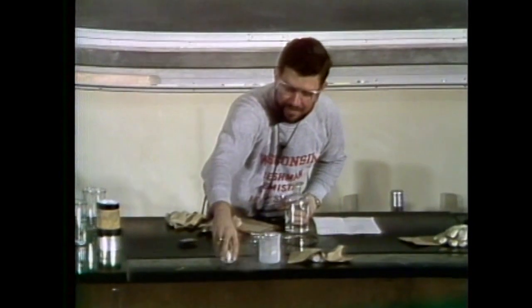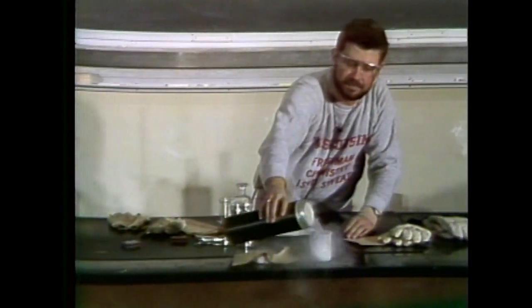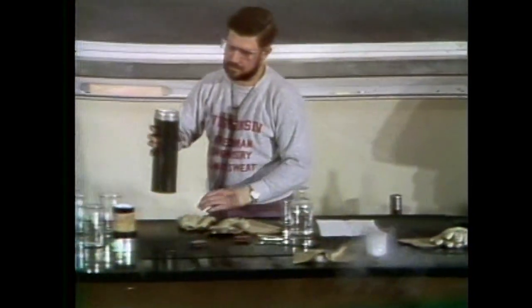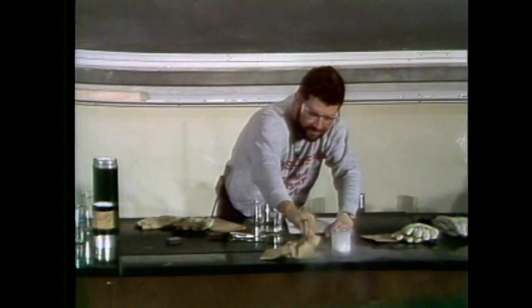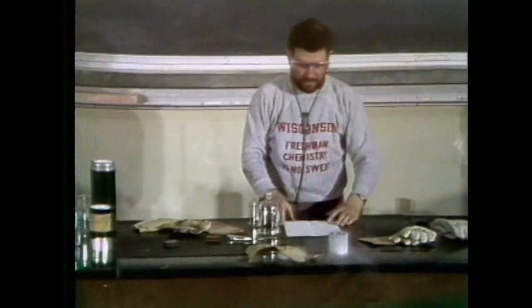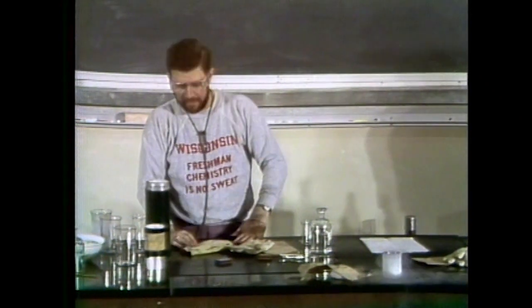Gosh, we'll try again. Here's another one. Let's try this one again here. And we'll let this one really cook for 3 minutes, okay? That wasn't a 3-minute egg, was it? Yeah, still in there. So we'll let this one go, and as it's cooking, we'll try to look at the effect of liquid nitrogen on other forms of life.